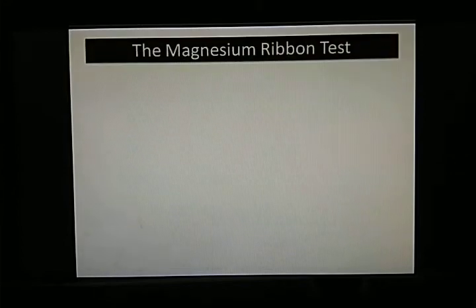So let us begin. The first experiment or test that we'll be discussing today is the magnesium ribbon test. Now, a magnesium ribbon is just like a simple ribbon that we have seen already in day-to-day life, but this ribbon is made up of magnesium. What to do in this test is that, first of all, let us see the diagram, and then I'll explain to you one by one the processes that occur in this test, or the chemical reaction.